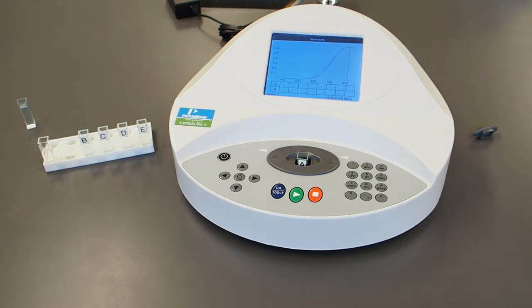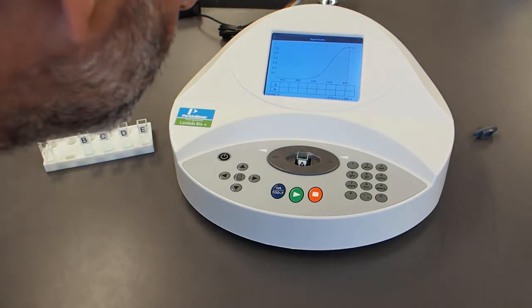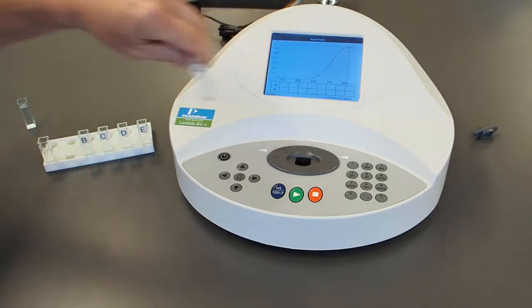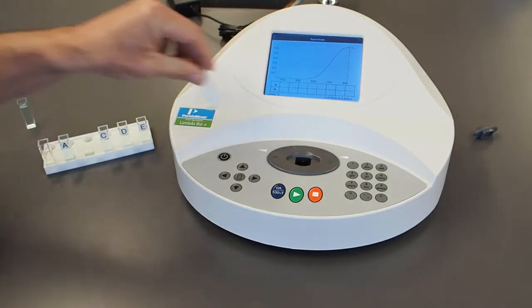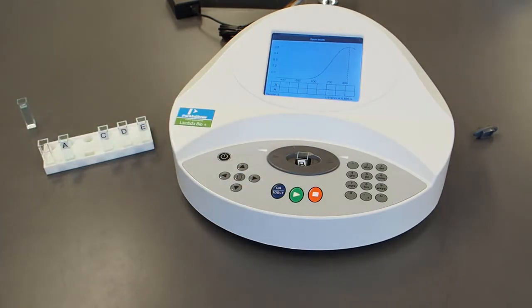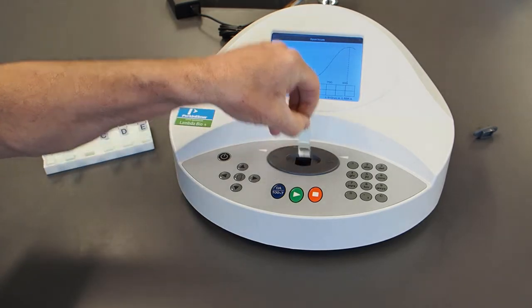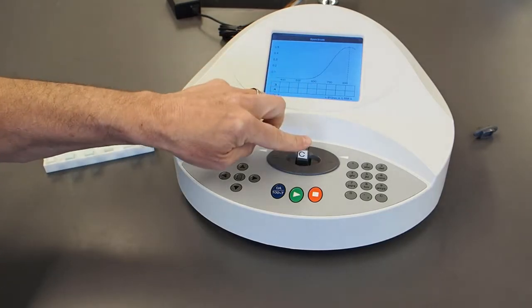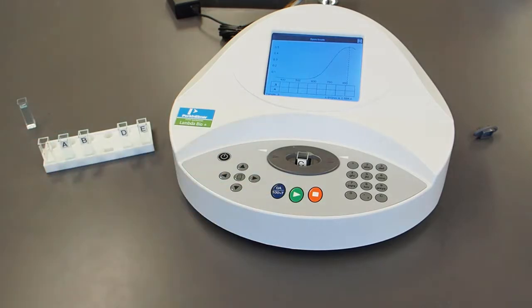It's 810, and we have our first reading, for sample A, it's 0.69 absorbance units. All right, then we'll look at our other ones at that same wavelength. Sample B, that is 0.555 absorbance units. Sample C, 0.382.